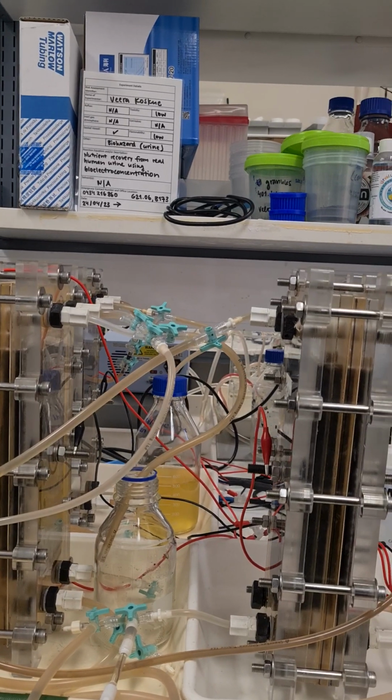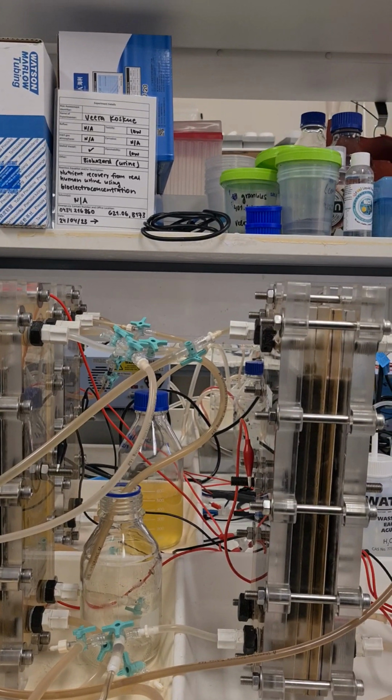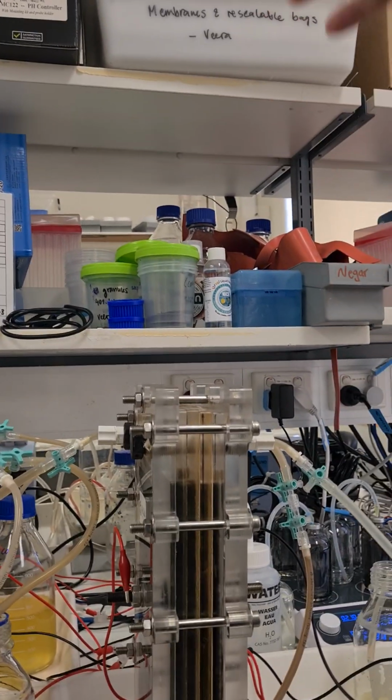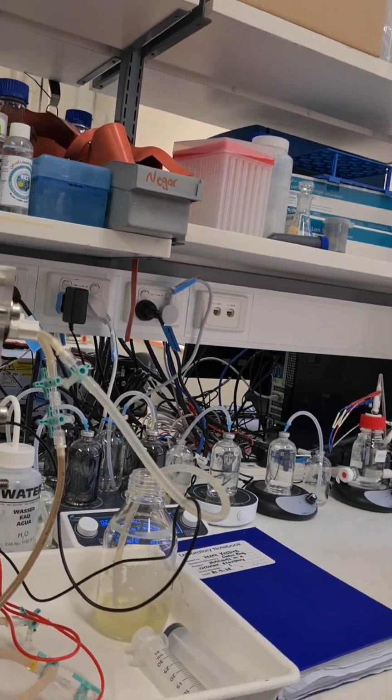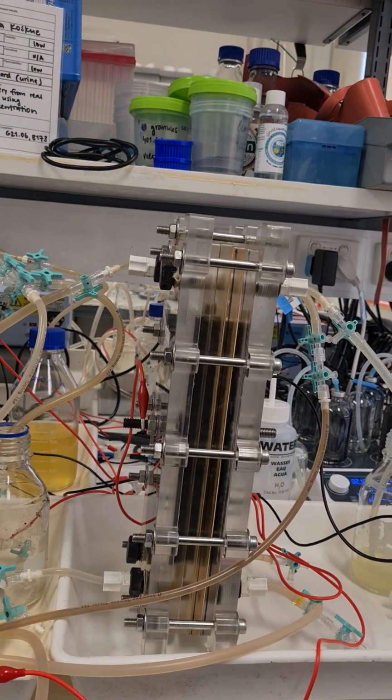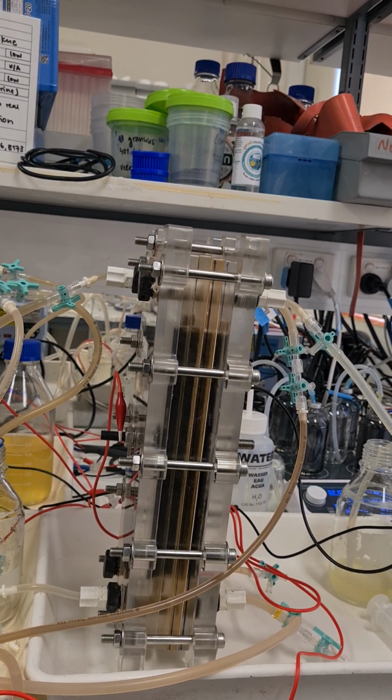Ideally all of this would be done in a fume hood, but I'm a bit limited with fume hood space, plus I need to use the potentiostat, which is here and shared by other researchers. Right. So yeah, the smell is a bit of a nuisance.